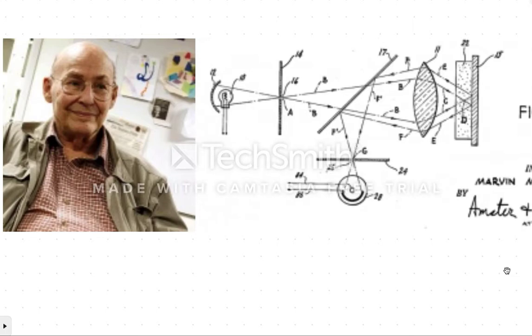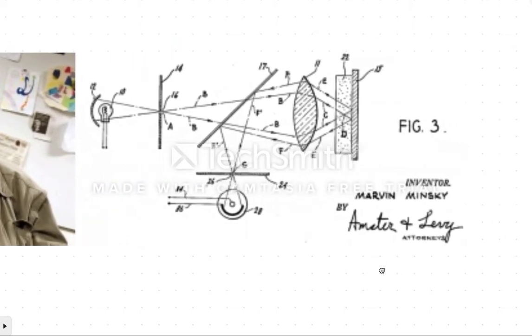In combination with fluorescent proteins, the microscope has evolved to allow images and real-time movies of in vitro and even some in vivo cells, which has allowed cell biologists to examine the structure and function of many cellular components and cells as a whole. This is his original confocal design.